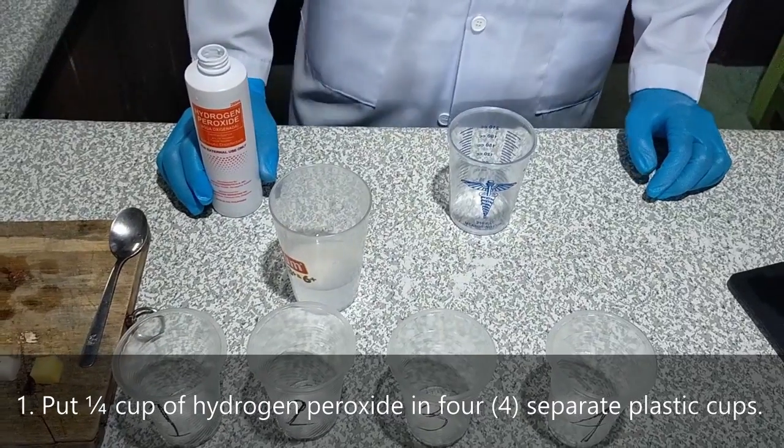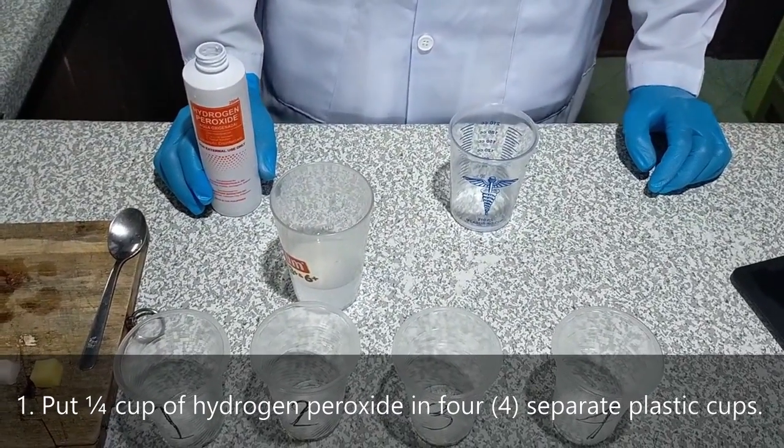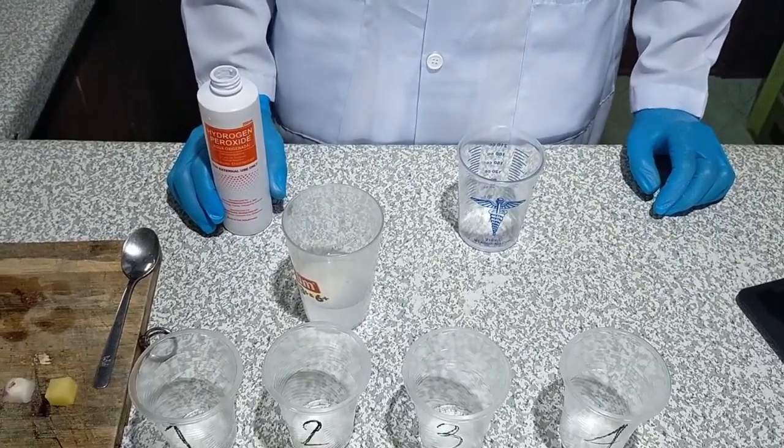First step, put 1/4 cup of hydrogen peroxide in 4 separate plastic cups.